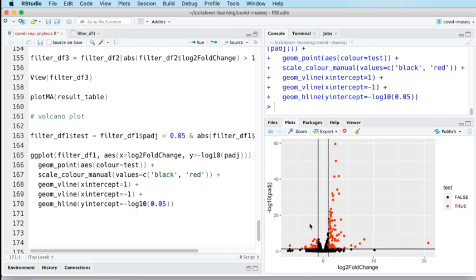We're overplotting severely here, especially in the middle of this plot. So there's an awful lot of points in the middle here. And so what we're going to do is a couple of things to relieve that to our geom point. We're going to change the styling of all of our points.